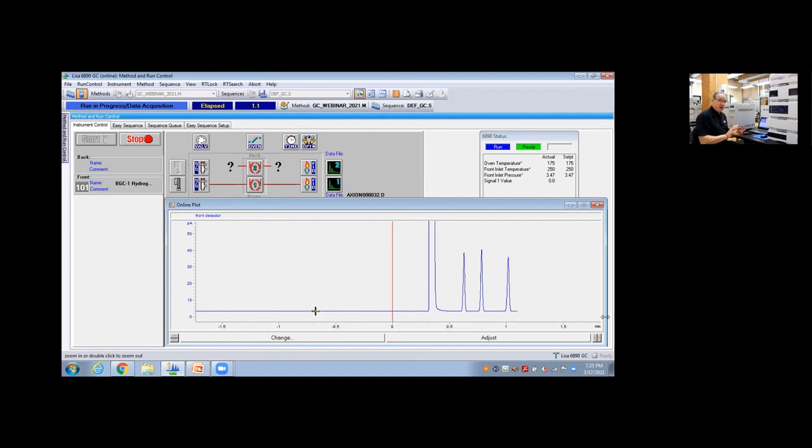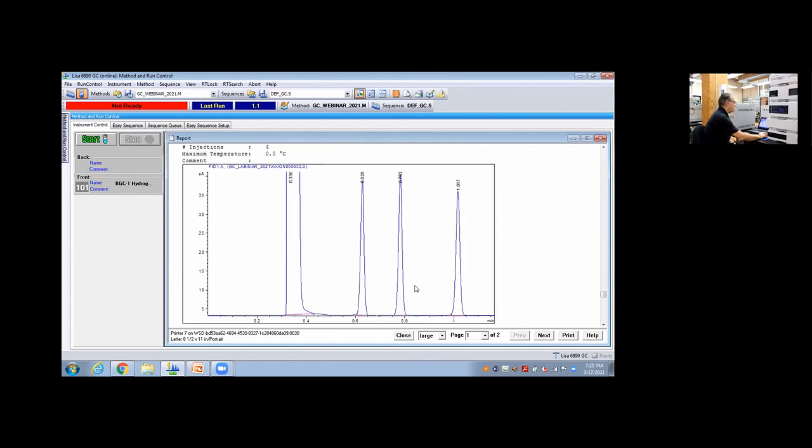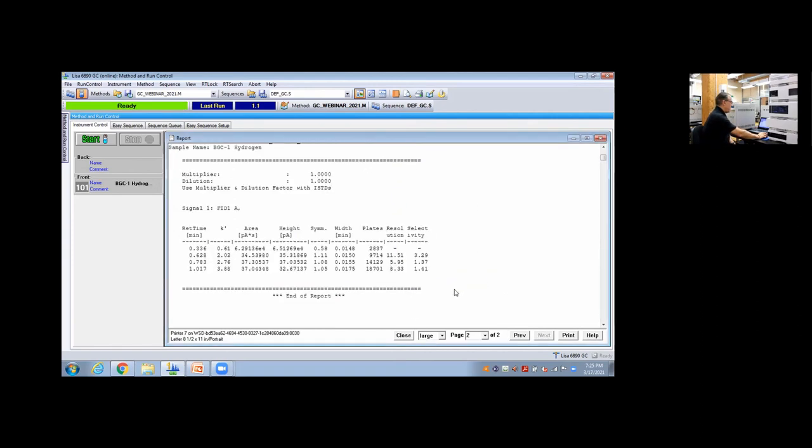Here we have our first peak, our T0, our solvent front, which has come off. And here we see our couple of peaks. Our first peak is off. And our second, this is the fun part of chromatography, the waiting thing. And our last peak should be coming off right around a minute. And there we are at right around a minute. Keep in mind, we just made that switch and give it a short little time to sweep out. But it looks like the separation is pretty similar. If we look at the chromatography, beautiful peaks, last peak comes off at right around one minute, same as last time. And our resolution has actually gone up a little bit. I think before we were 7.76. Now we're 8.33. So we are getting the same retention times, we are getting essentially the same resolution, slightly better because of that slightly skinnier peak.